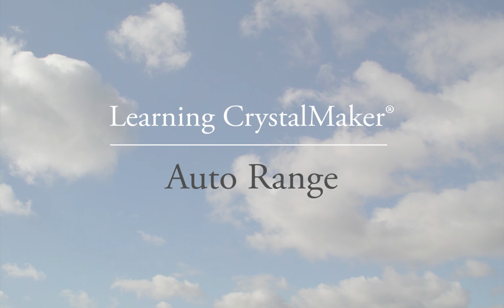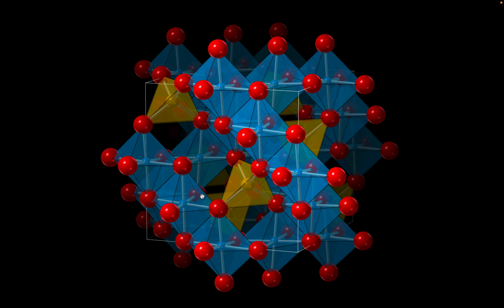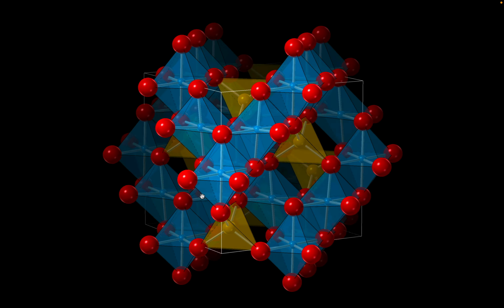Welcome to CrystalMaker 11. This tutorial introduces you to the auto range command, which we added in CrystalMaker 11.